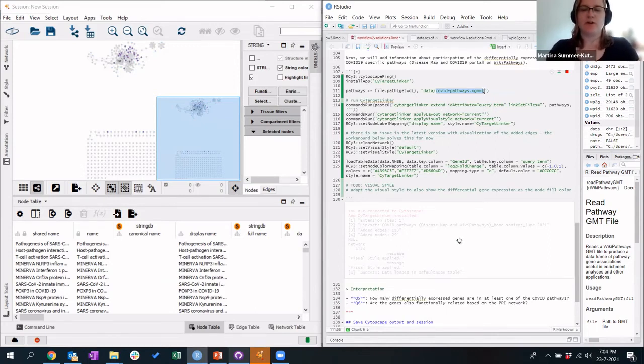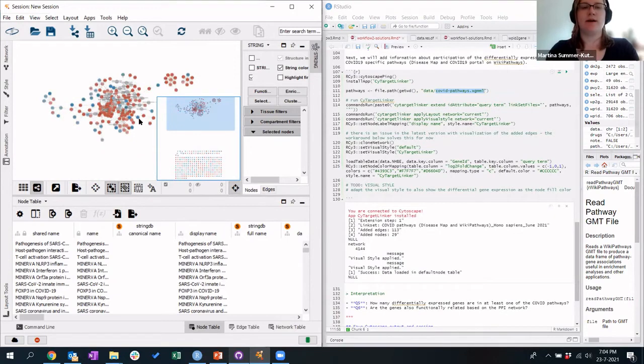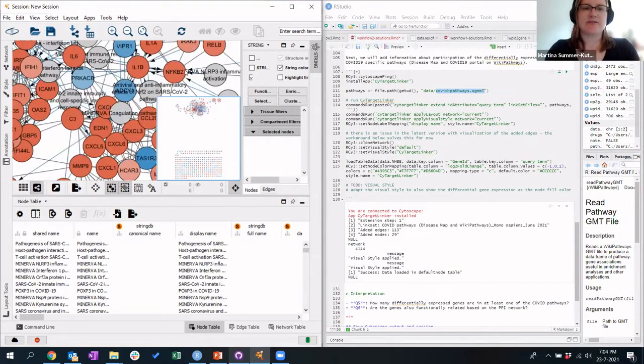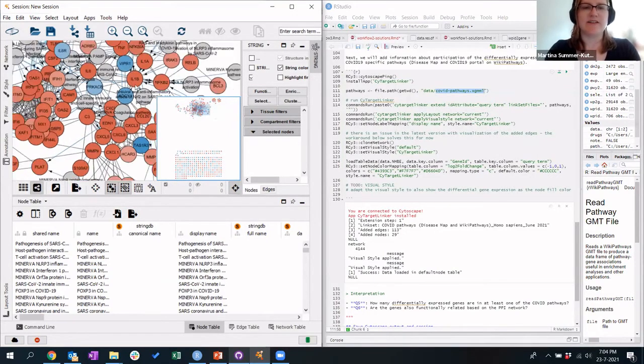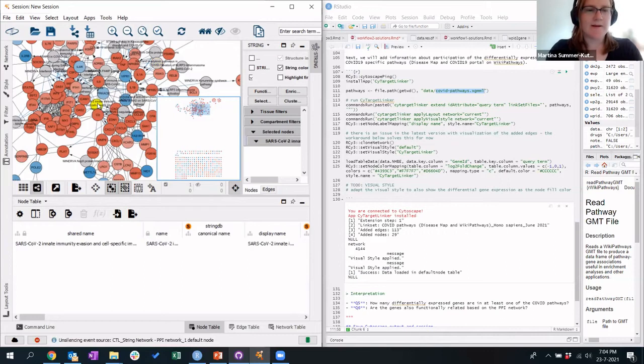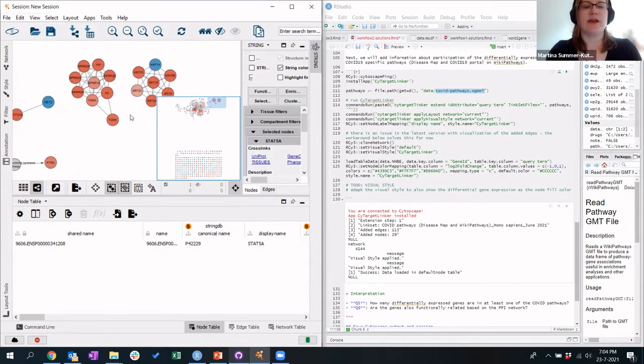That really helped us. We ran this analysis also for purposes of curation efforts, right? So what are the things we want to curate? What we see is that there are quite some immune-related pathways in the center here. As you see here, this is a specific RAS and bradykinin pathway. Here we have some innate immune response and so on. Some have more genes, some have fewer genes, but there's still a lot of genes that are not present in any pathway. For example, this whole cluster here is very strongly upregulated, but not present in any COVID pathway at the moment.